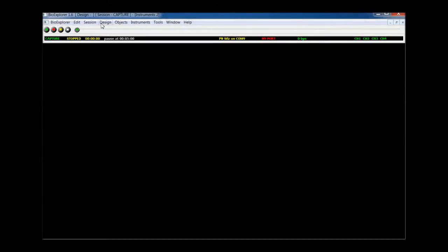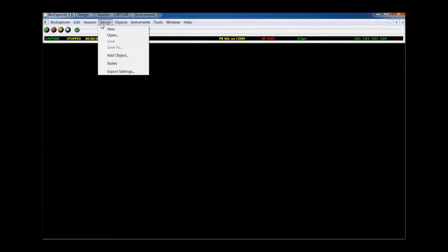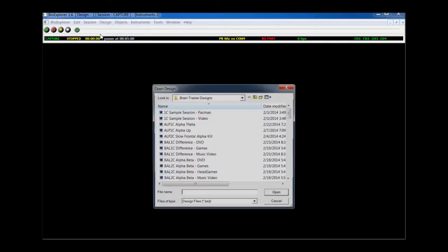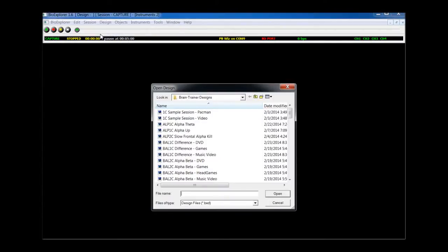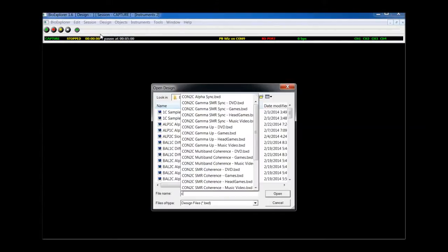You can easily find the design you want by selecting Design, Open, and start to type the name. A list of designs in that category will come up, from which you can select.